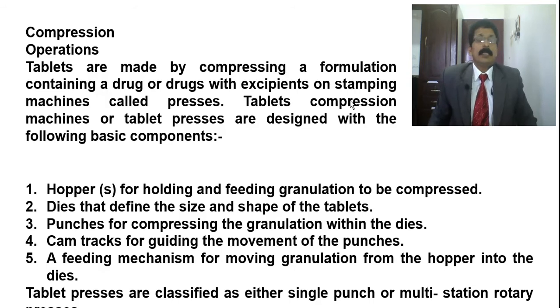This is our tablet department which we discussed last class regarding the in-process checking. We discussed the hardness of the tablet and how to test it, the friability tester, and weight variation, and also dissolution and disintegration and how the evaluation can be done.